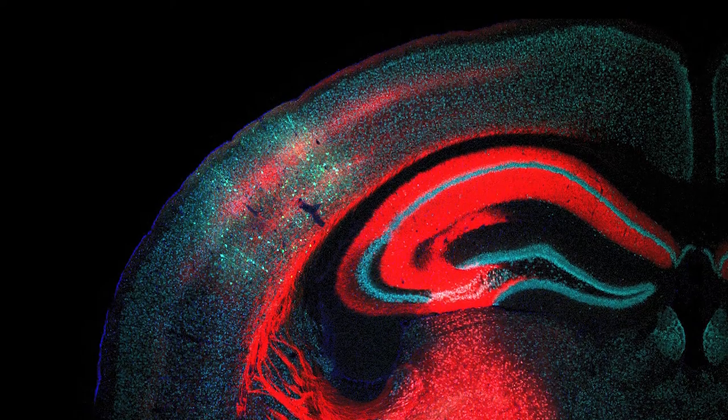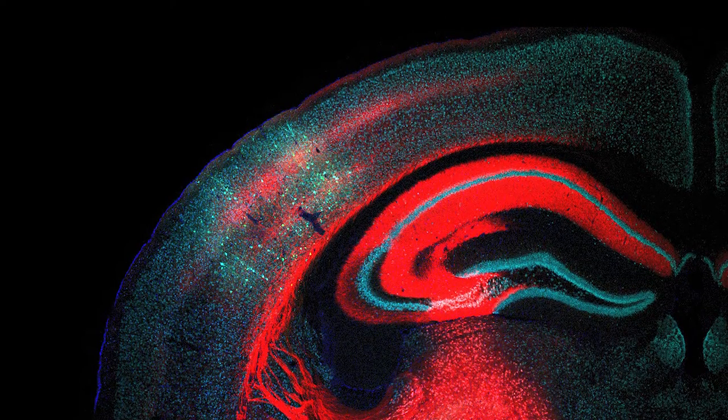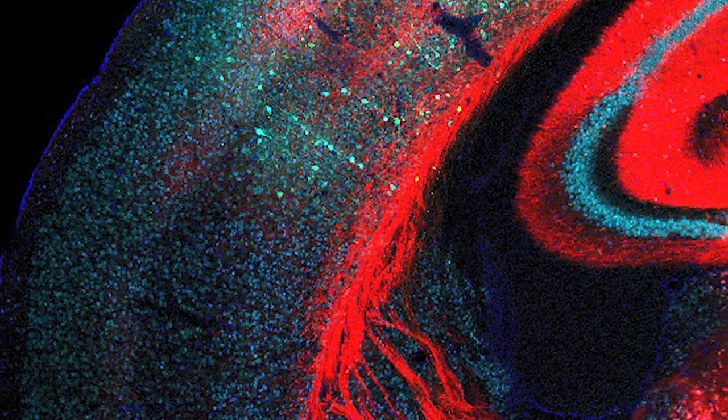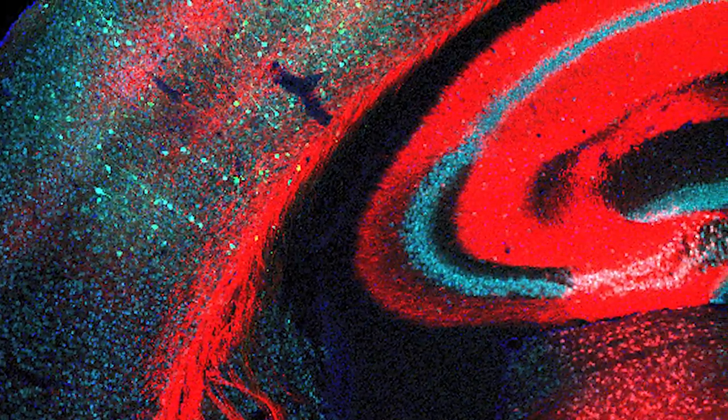What we're trying to find out is what the activity of the astrocyte means, because we can see in the calcium ions how there are some activity patterns, but we don't understand what they're doing.